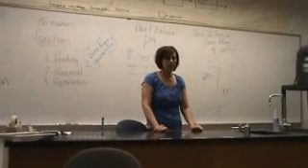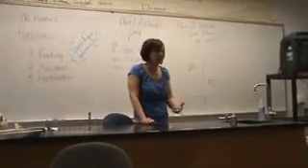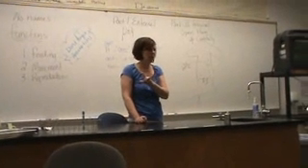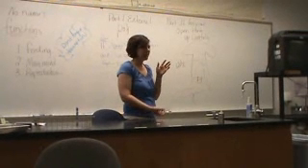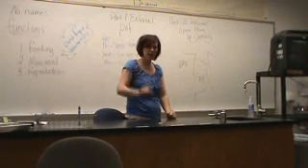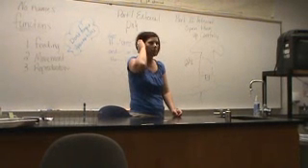Okay. So I wouldn't, yeah. Just take each situation as it comes about. Just use your best judgment. And we do have a model that I will set out over here. It's a museum mount, and it does have the things labeled on the back. They're labeled with letters on the front, if they want to look at it. I'll set out another dissecting microscope. If they want to carefully carry their pan to put it under the dissecting scope to zoom in on something, that's fine as well.